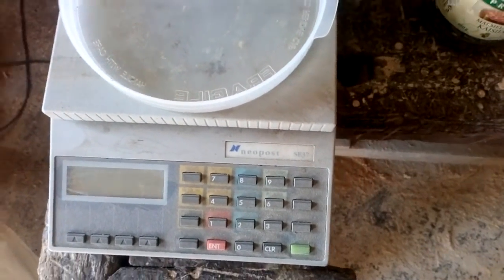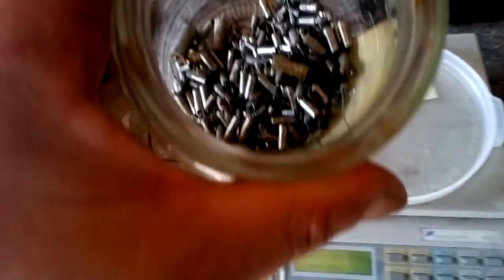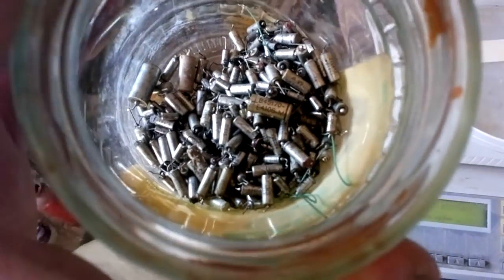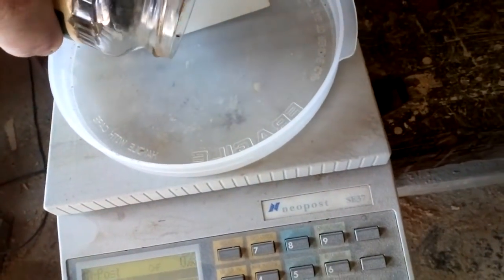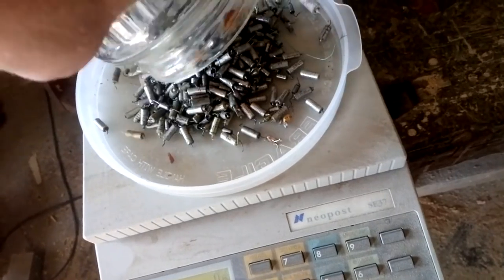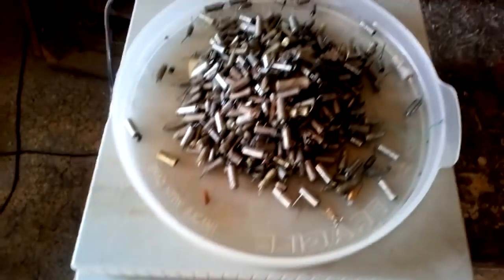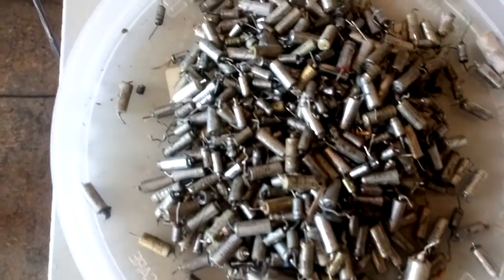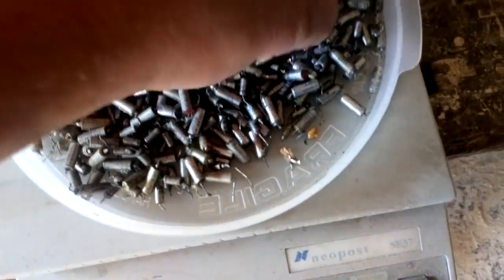First, we're gonna see how much tantalum we got and this is just metallic tantalum. Scale on zero and let's go. Here we got 352 grams of metal tantalum — some wire there, a couple of big ones and mostly middle ones.